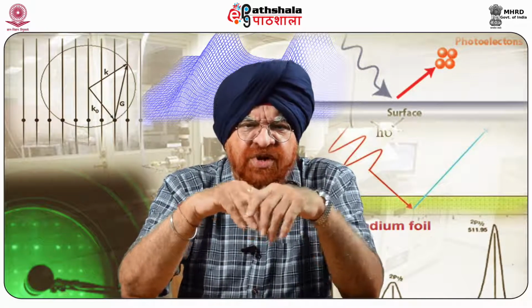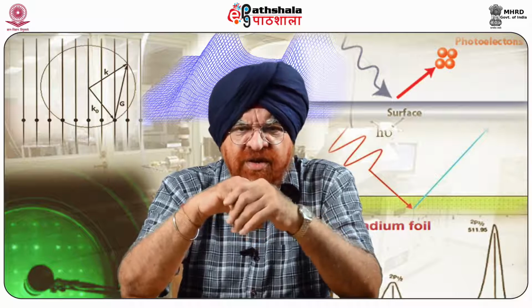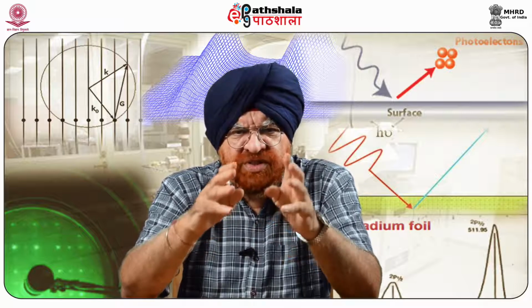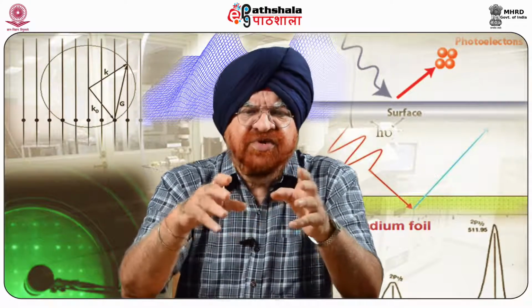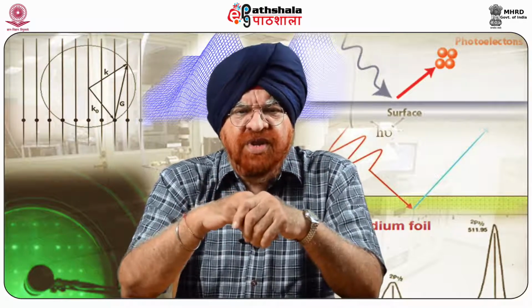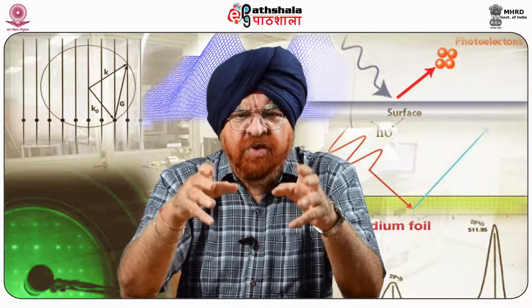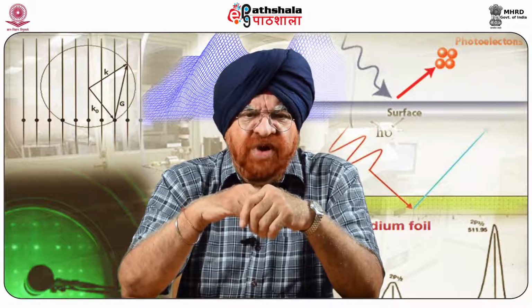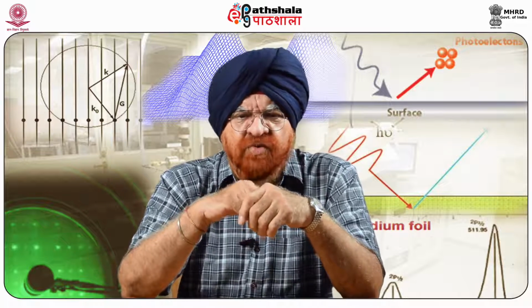The overpotential depositions of lead and platinum on graphite are used as examples to illustrate the wealth of information which can be extracted through this equipment. The lead exhibits a deposit topology consistent with conventional diffusion controlled mechanisms, while platinum shows much more complex behavior.